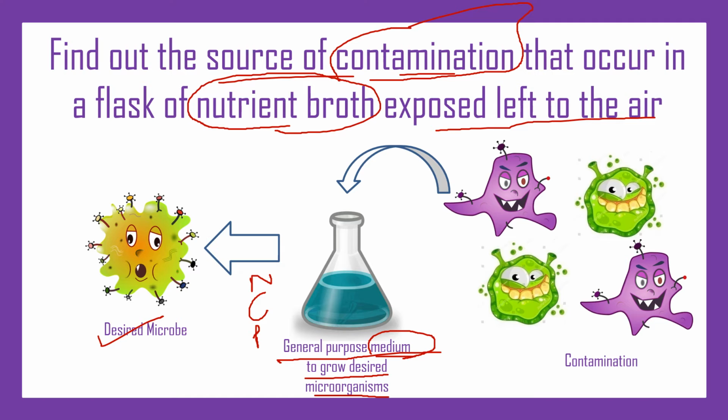So if you have worked in a microbiology lab, then you must know that before culturing the microbe, we must prepare the medium which contains all the essential nutrients for the growth of the microbe, and we have to prepare it in the sterile condition, otherwise contamination may occur.